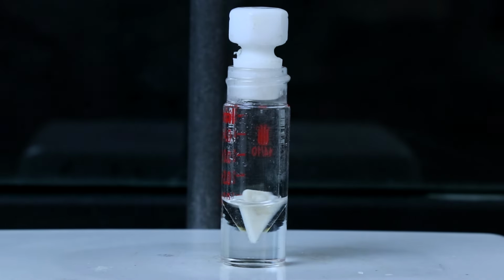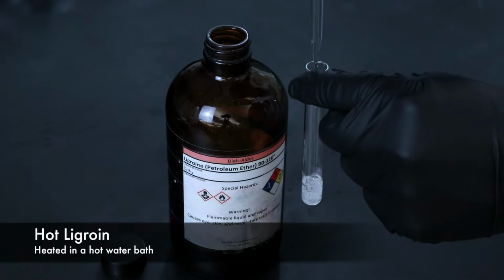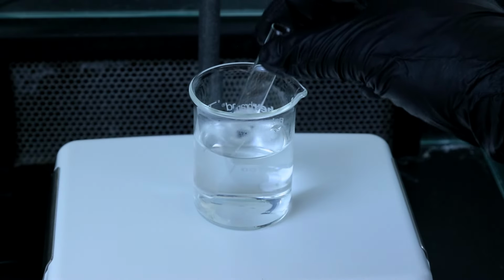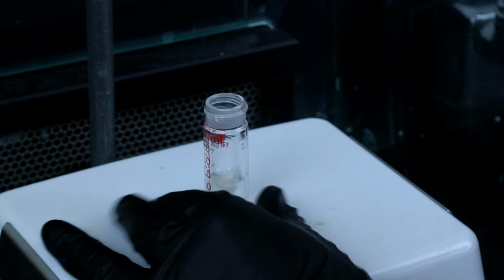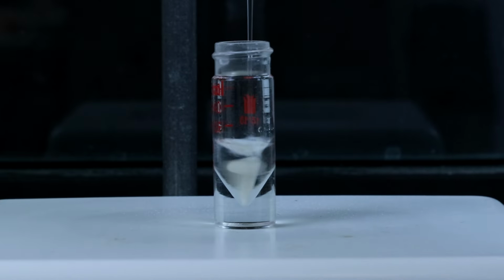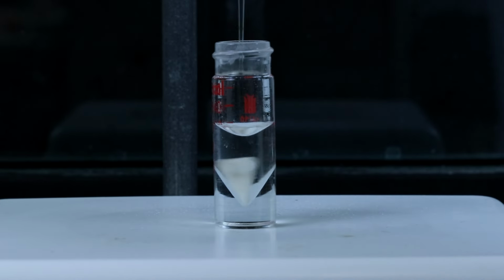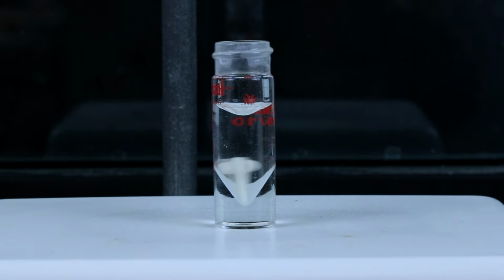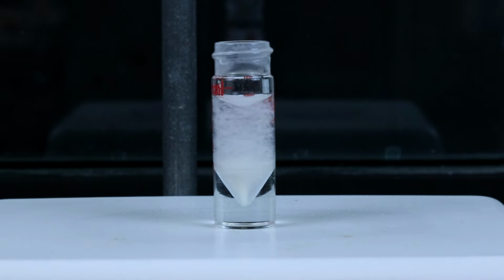After all of that, the derivative reaction is now done, so I'll prep some ligroin by placing it in a test tube and putting that in a hot water bath to heat it up. Then I'll remove the cap from the conical vial and start adding the ligroin until the solution reaches a total of 4 milliliters. And as I continue to add it, you can actually start to see the derivative solid coming out of solution.